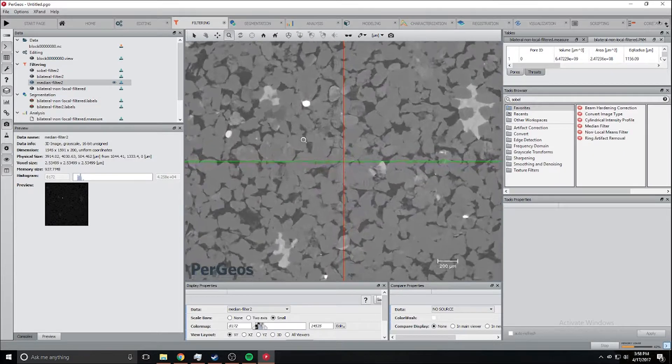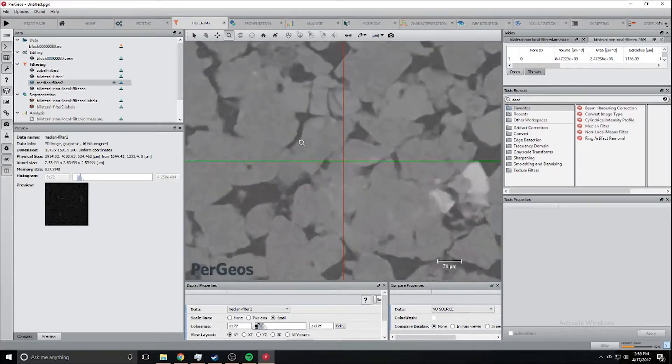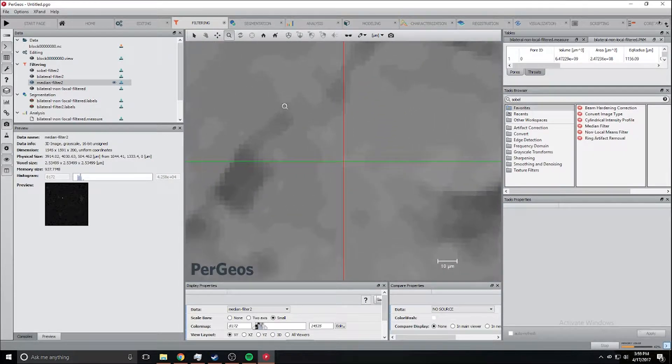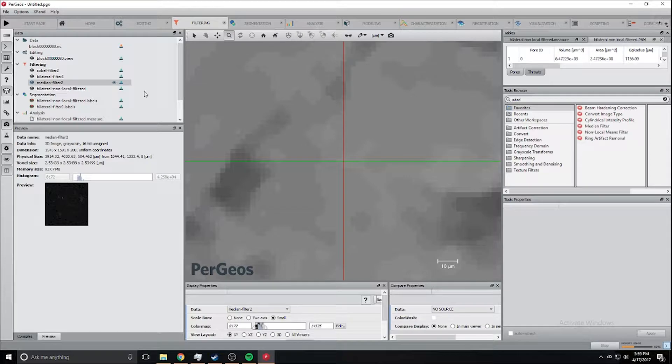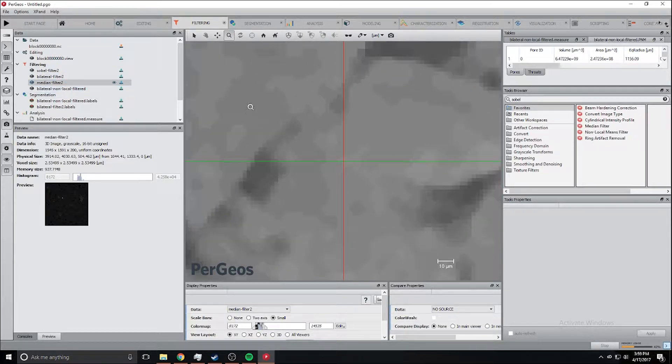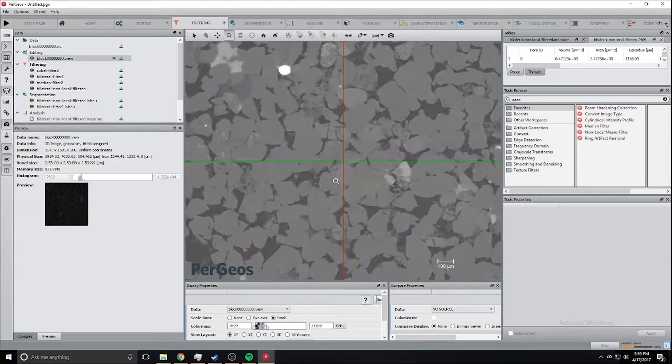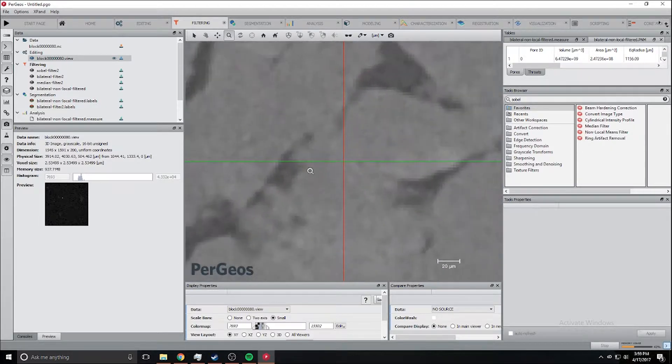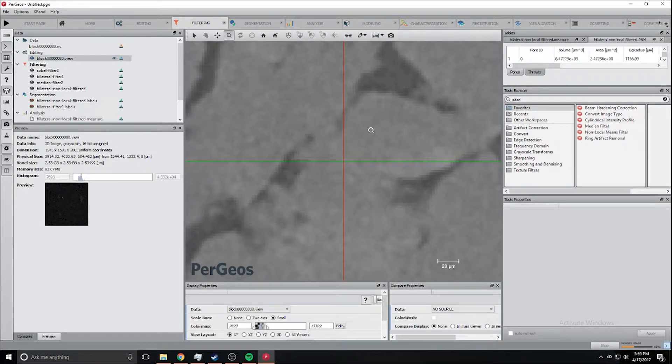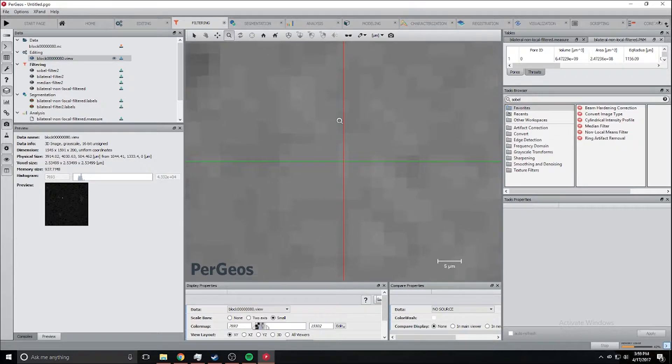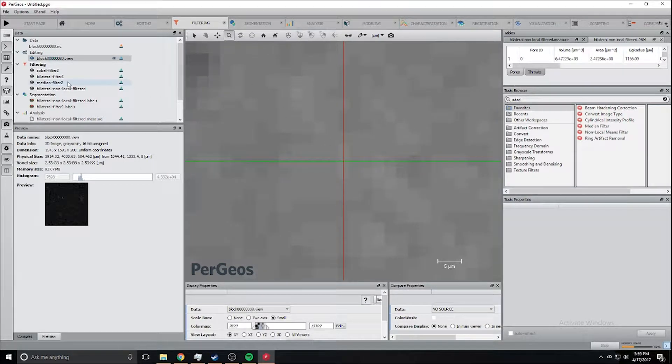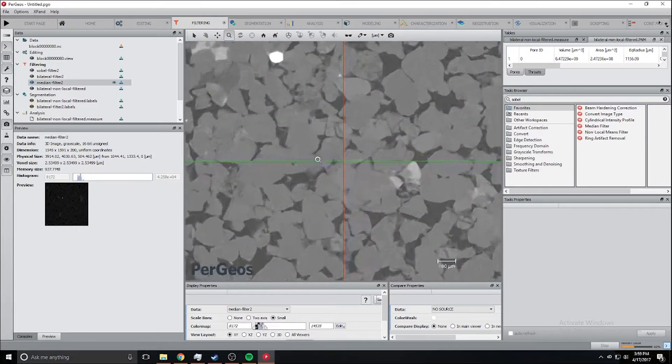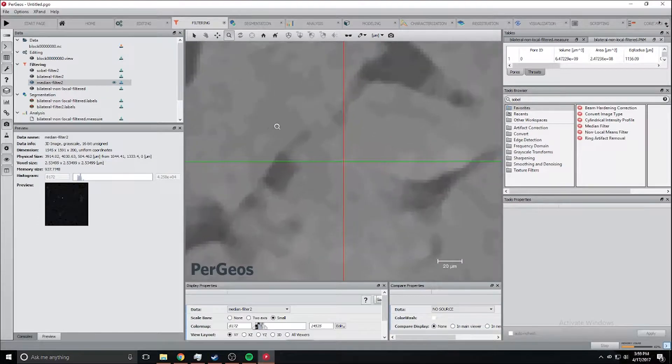This filter doesn't preserve edges that well as you can see right here, but it groups and takes away some of the noise. If we look at this one it's extremely noisy, like there's a bunch of small one pixel segments that are different colors.